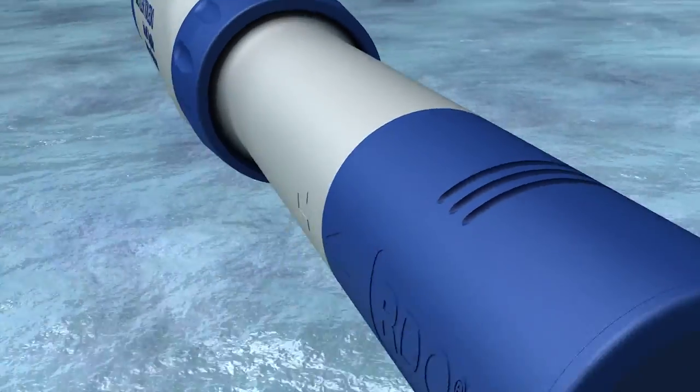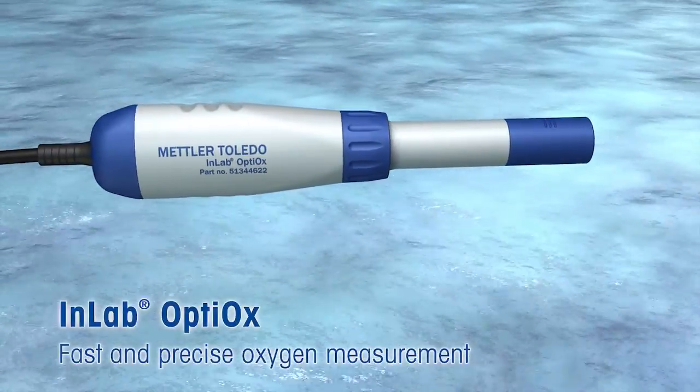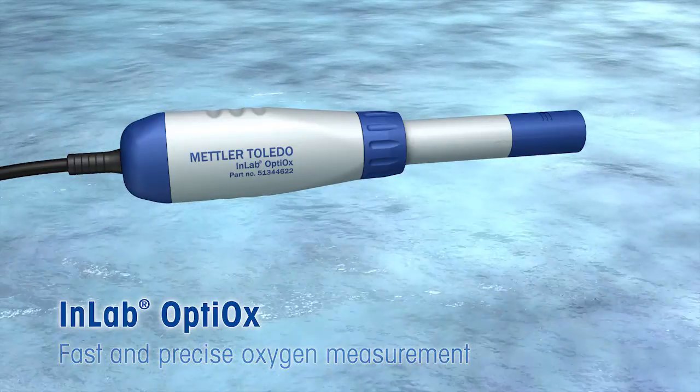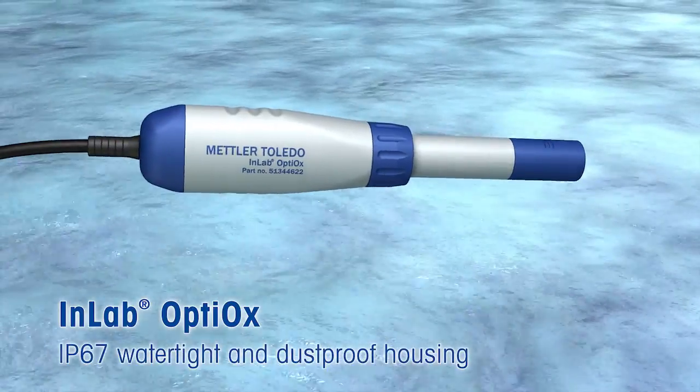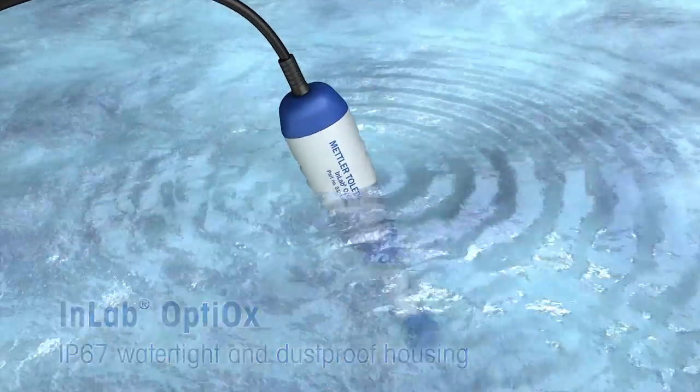The actual measurement takes place at the in-lab Optiox, the heart of Optiox. The whole system is watertight and dustproof according to ingress protection IP67. The sensor can be fully immersed into the sample until it has reached the optimal measurement position.